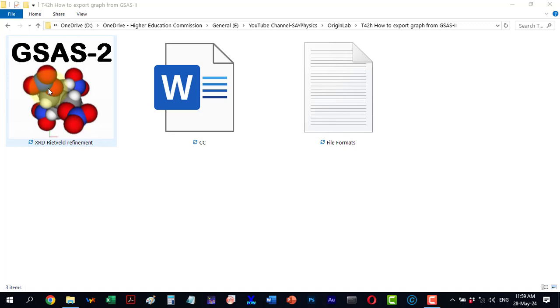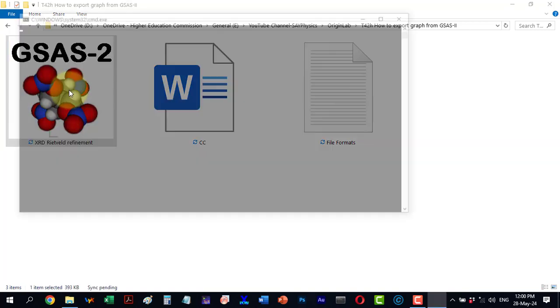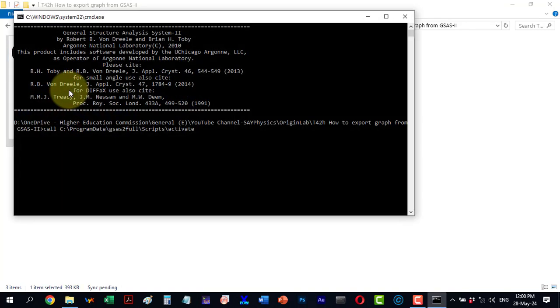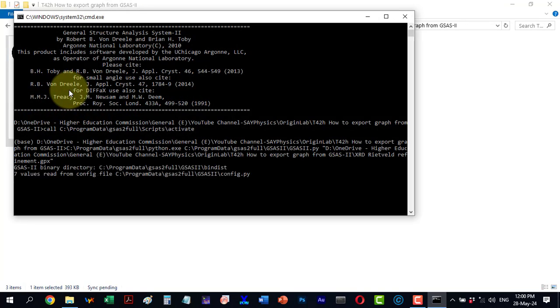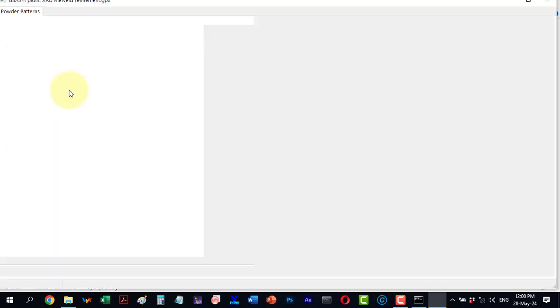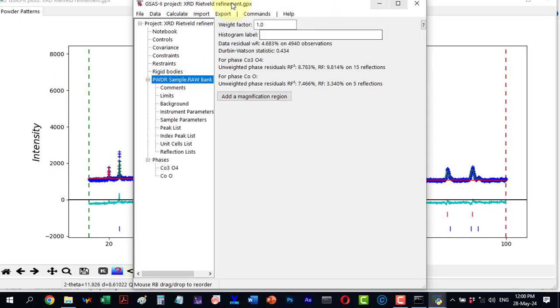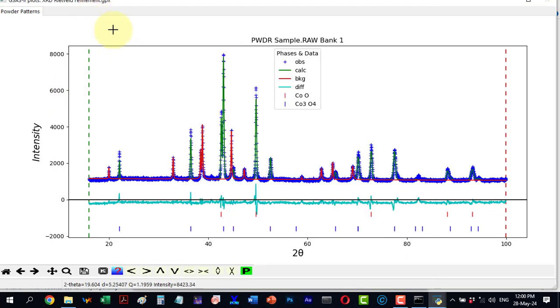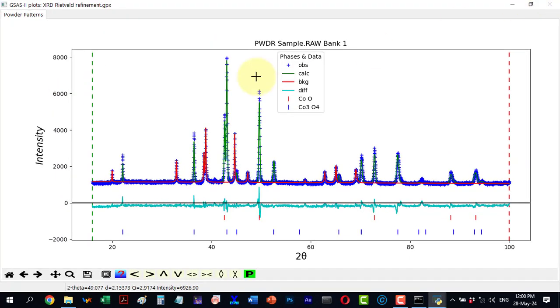In this video we will discuss how to export a graph from an already finalized GSAS2 project. This file is a finalized GSAS project. Let me open this file. Here is our finalized project.